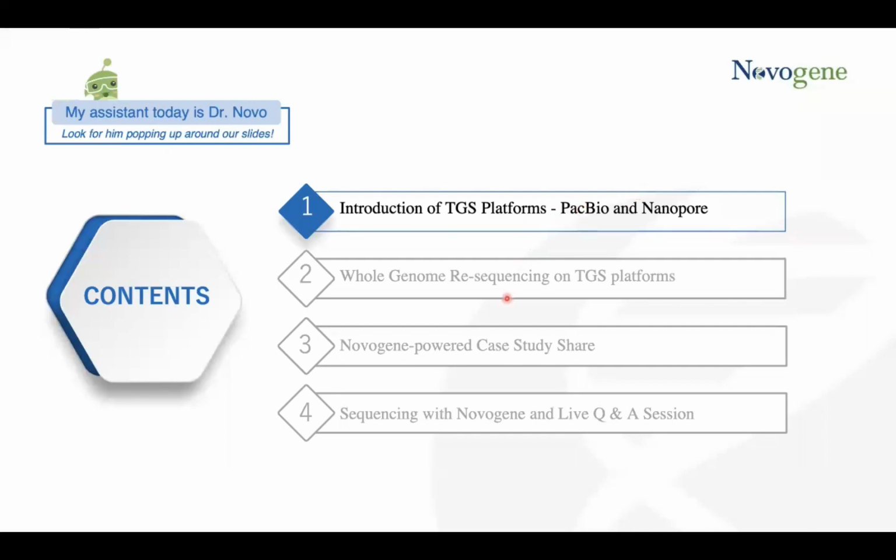Second, I'll go through the re-sequencing service workflow and TGS specifications. Great to know if you start a re-sequencing project. Next, we will learn about a Novogene-powered real case study using such service, and then wrap it up with a Q&A section.